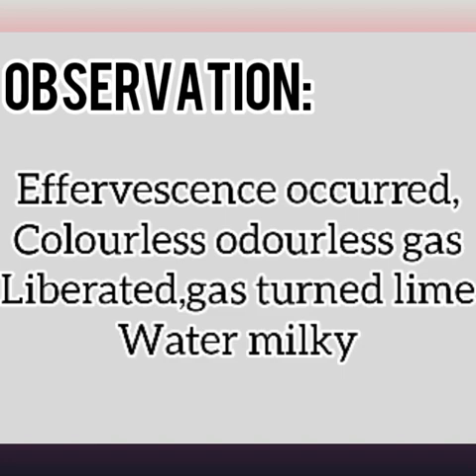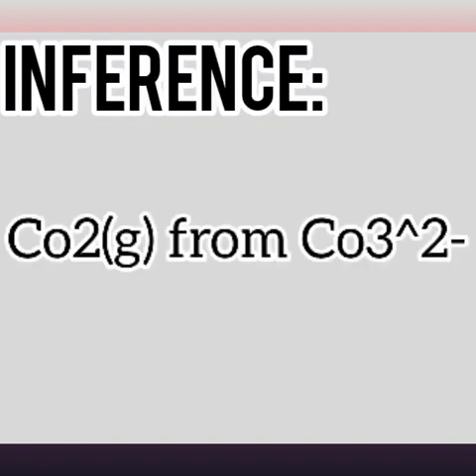Now for your observation, effervescence occurred. A colorless, odorless gas was liberated. This gas turned lime water milky. That's for your observation. Then for your inference, CO2 gas, as in carbon dioxide, from CO3 2- was formed. This observation and inference, the dilute HCl plus your solid sample of X, will also give you the same observation and the same inference.